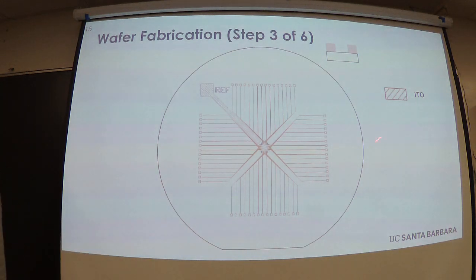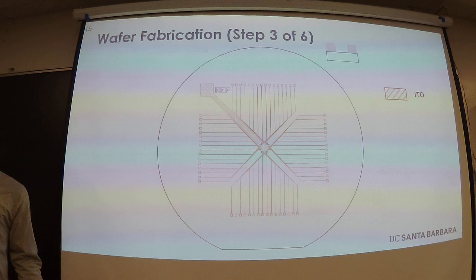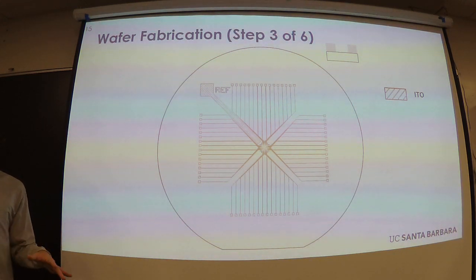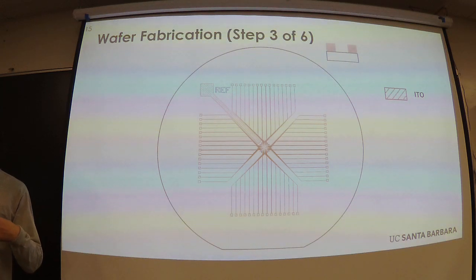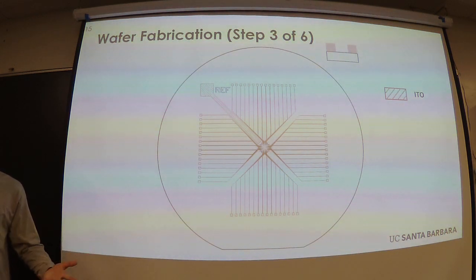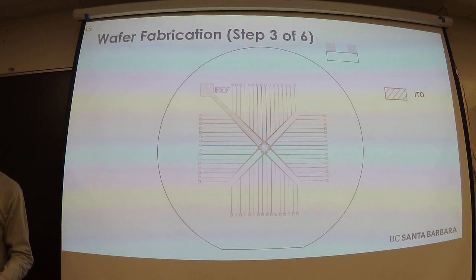And there you have it, electrodes on our wafer. And this is excellent, this is kind of exactly what we wanted, but in order for them to be useful, they need to be insulated. And the reason for this is there's going to be this media on top of it. And this media for the cells is going to kind of short all of your electrodes together. So if you try to read signals out or send signals in, all you're going to get is this jumbled mash, and it's not really going to be effective at all.